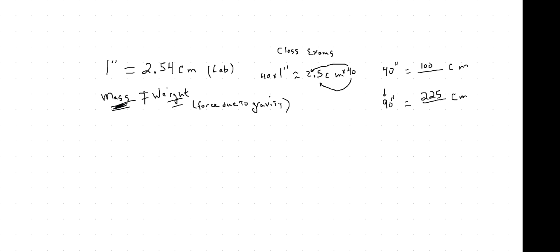Now we're going to measure mass with 2 different devices in the lab. The first one is called the centigram balance. We call them balances. I like to call them scales, but the chemists say scales are what fishes have. So we call them balances. And this is going to measure mass to 0.1 grams, so 1/10 of a gram accuracy. So it's not super accurate.